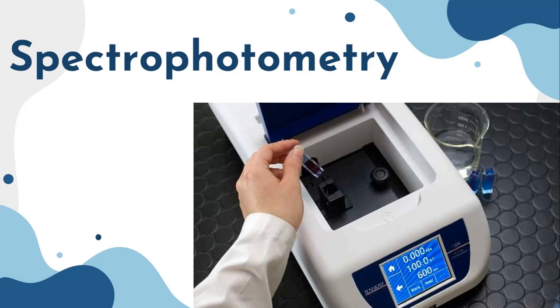Alright, so hello everybody. This will be the continuation lesson that we discussed in the previous meeting. For this session, we're going to focus on a specific instrument, a specific method that we're going to use in the lab, especially when we're doing chemistry or biology related experiments. And this is what you call spectrophotometry, which involves the instrument called the spectrophotometer.